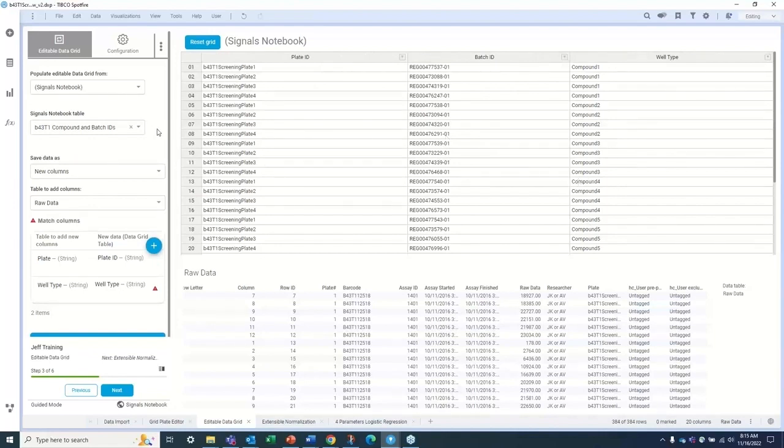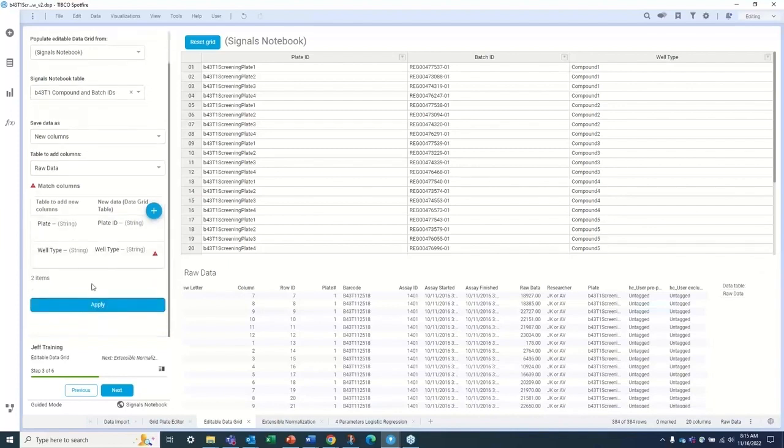So that's on the in vitro side of things, of how you would connect Signals Notebook with Signals VitroVivo, which is, again, really quite smooth. What it does too is it avoids the duplication. And being an ex-scientist, I know that duplicating things in different documents in different areas is time consuming and wasteful. So let's not do that. Let's actually connect these pieces of software applications that will really help you with your work.